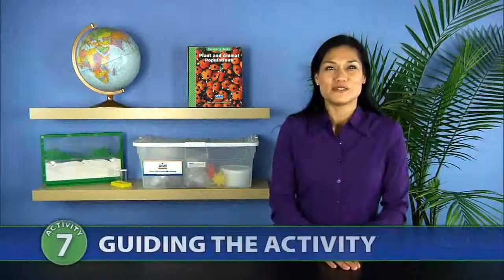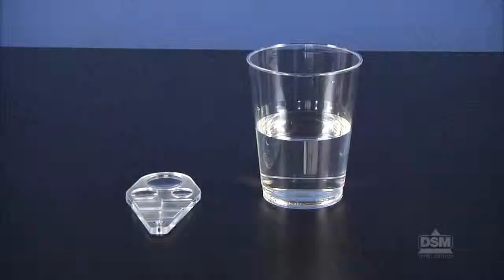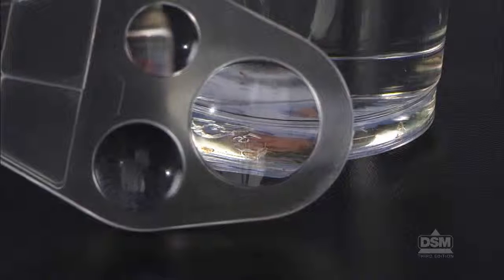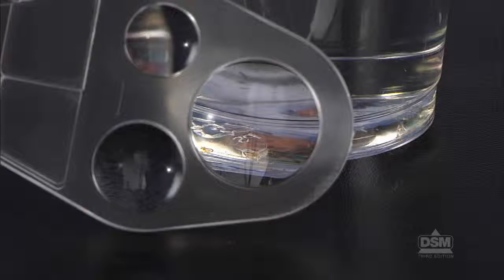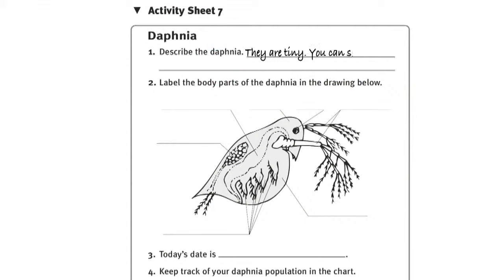To begin the activity, inform students that they will be investigating an aquatic animal, which is an animal that lives in water. Distribute a container with Daphnia and a magnifier to each team of 2. Allow students time to examine the Daphnia. Encourage them to look closely and to watch for tiny objects moving through the water. Distribute Activity Sheet 7 and have students describe the Daphnia on their activity sheets.